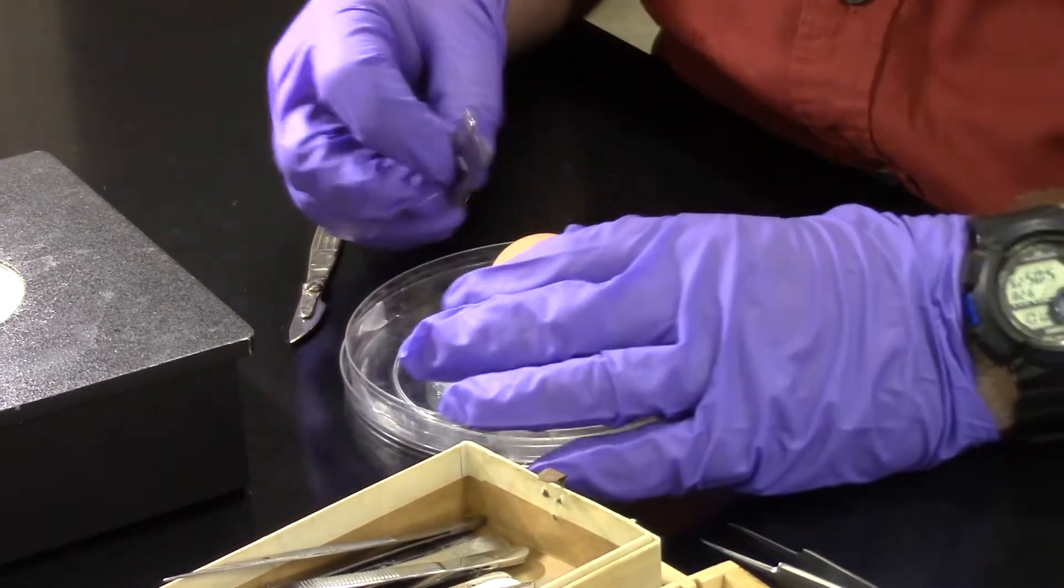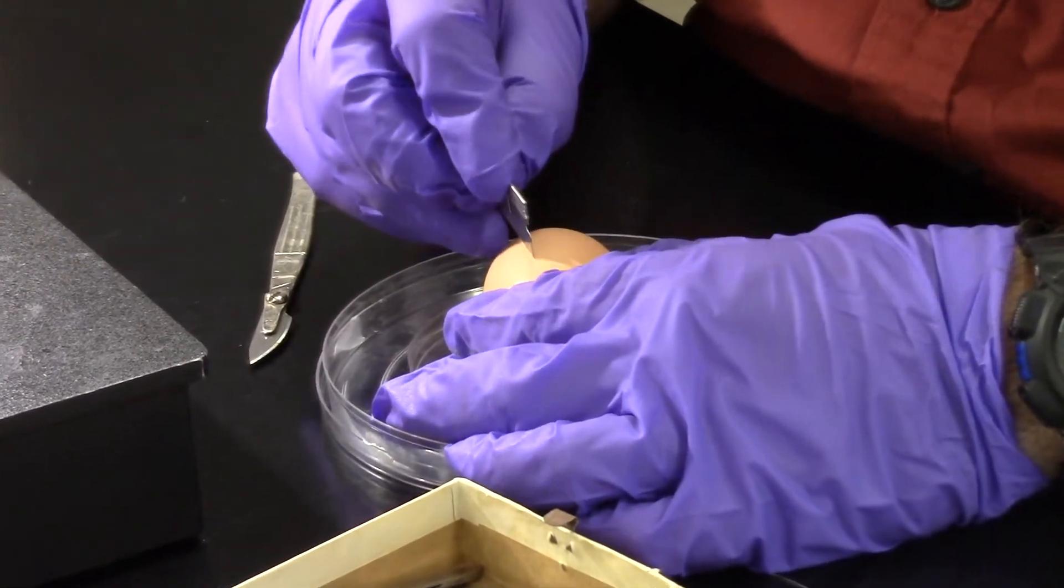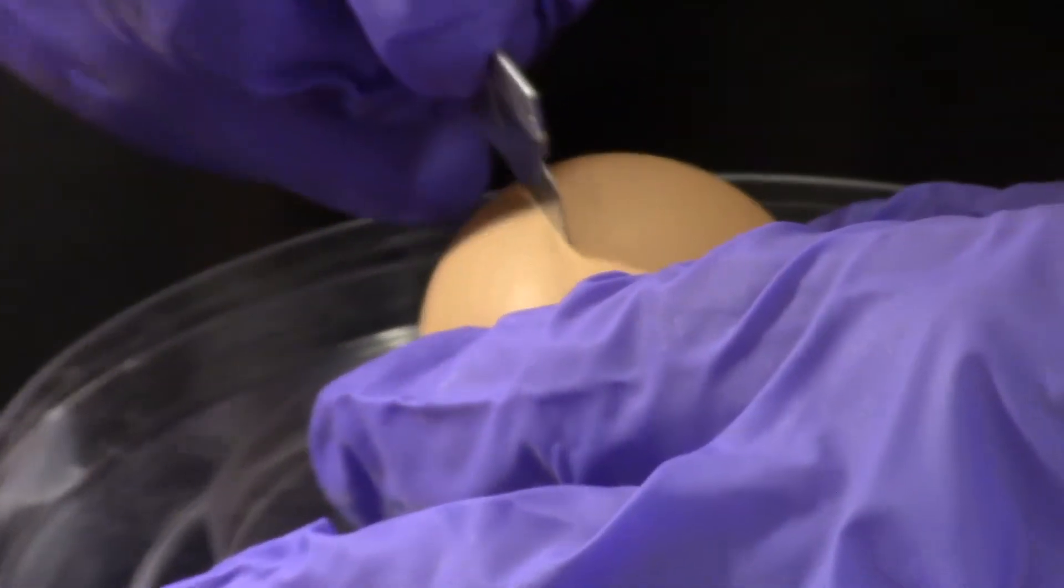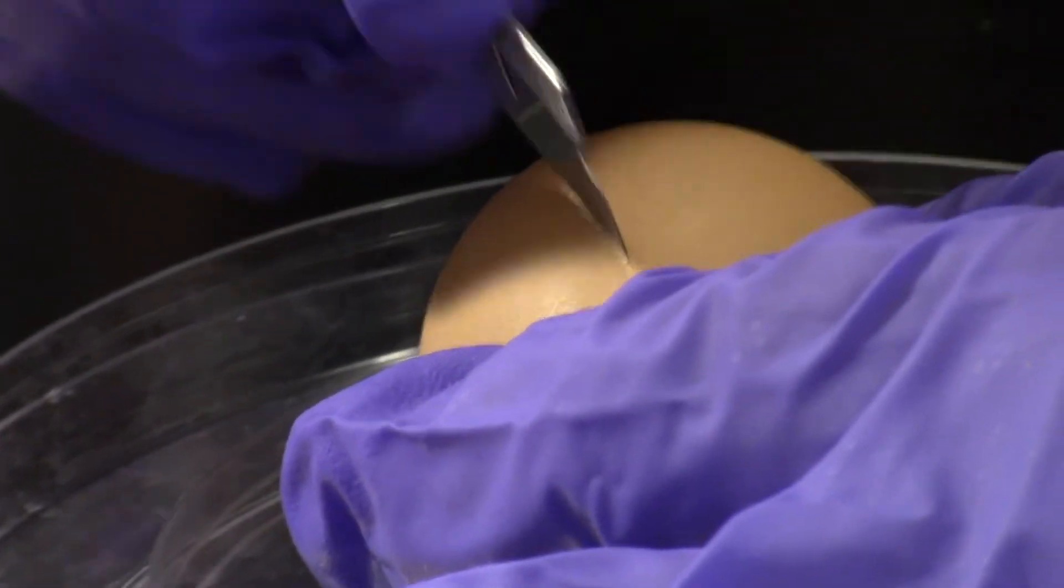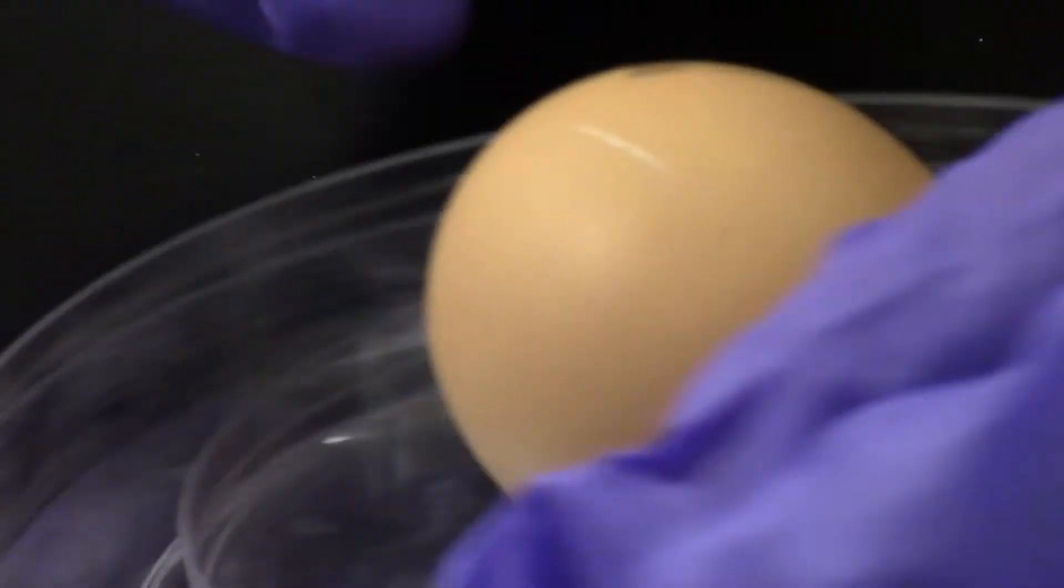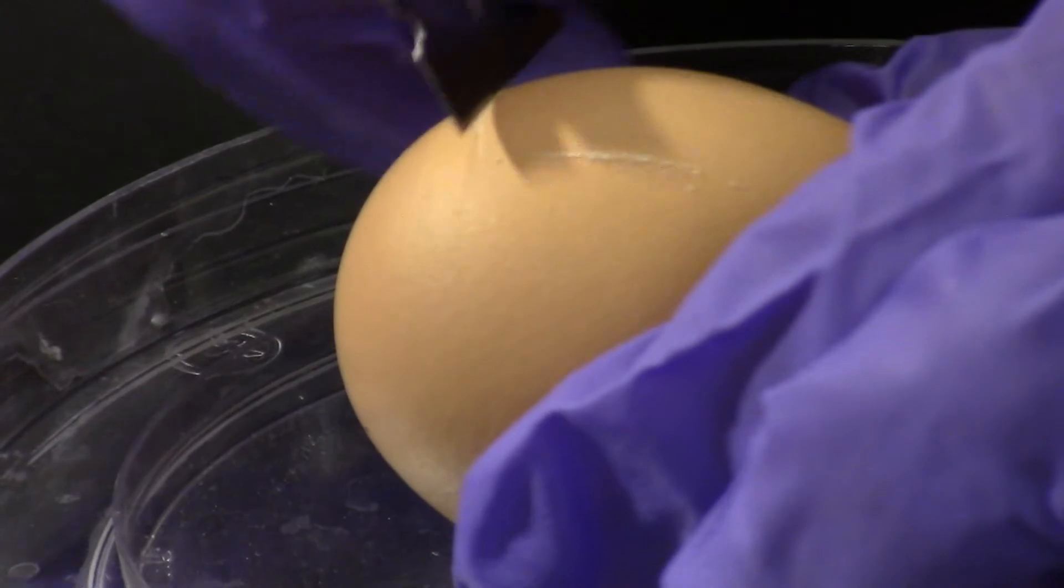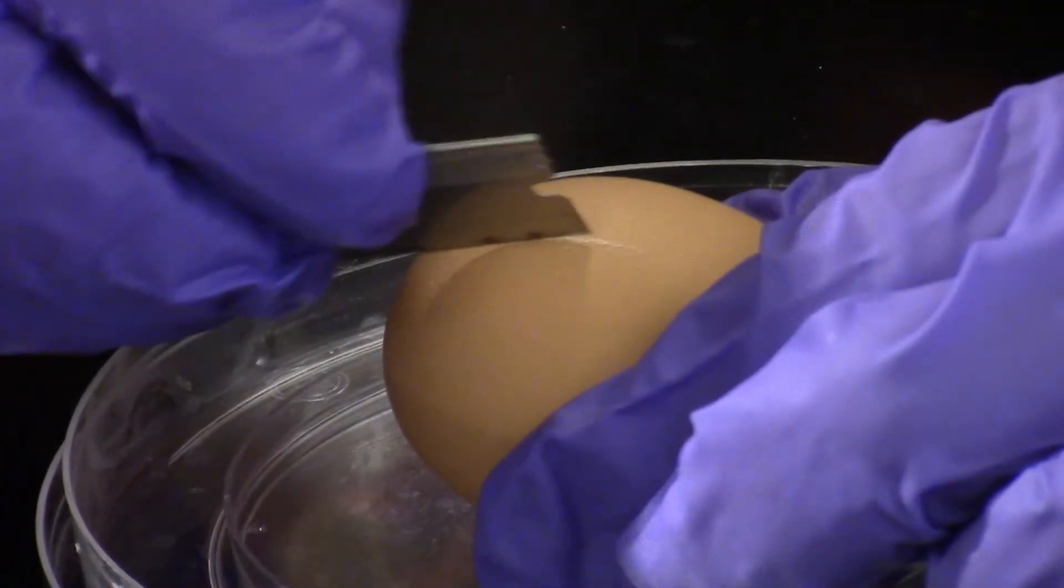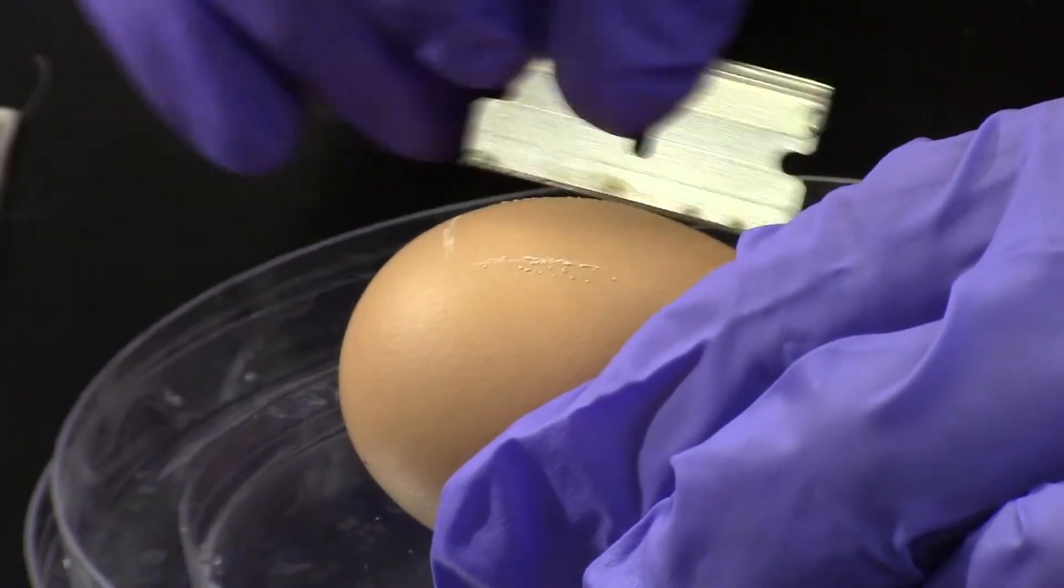I'm going to start here by sawing. Notice I'm not pressing down hard because I don't want to crack the egg. I'm sawing with a very sharp razor blade. I'm actually making a tiny bit of little sawdust here. It's not wooden sawdust, but calcium of the egg. I want to try to get the entire area over top of the chick embryo open so that I can see inside.